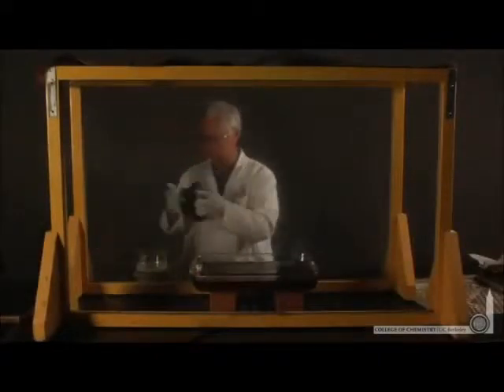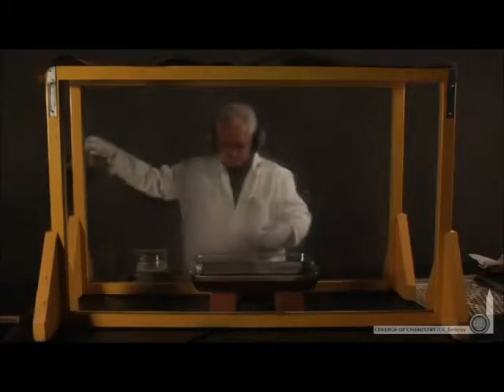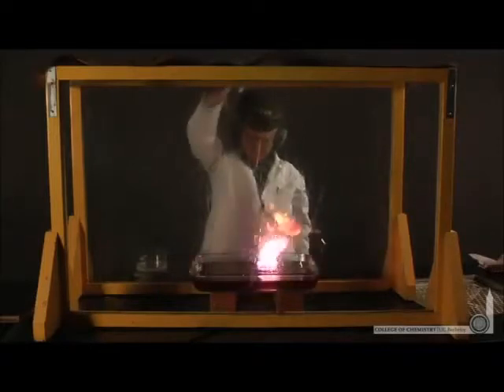That's because potassium, the lowest ionization energy so far in our series, requires the least amount of energy to ionize, but again, that same amount of energy is being released when water is reduced to hydrogen gas. Now here's rubidium metal. And you can see rubidium, which has the lowest ionization energy, releases the most energy in the sequence.